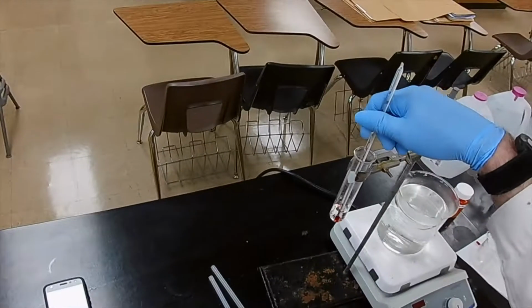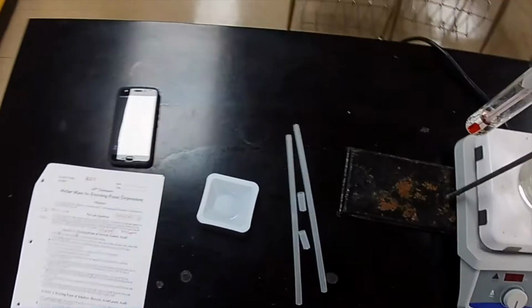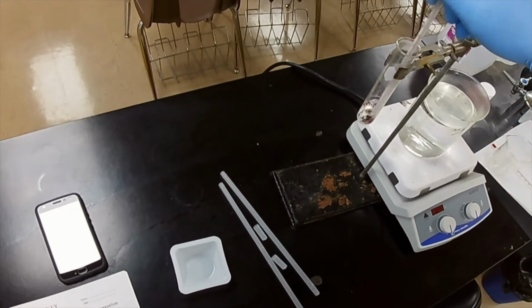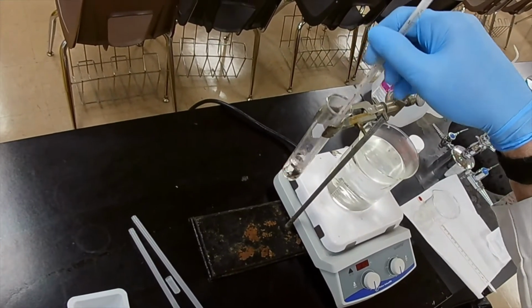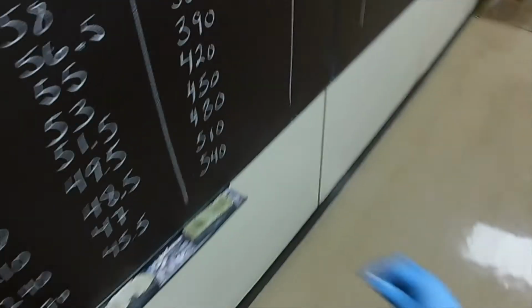Okay. 6 minutes coming up. 360 seconds. And this is 42. Okay. Ten seconds to the next one. I thought I saw a crystal, but I don't believe so. 41. Because the temperature's still dropping, and I think I knocked a piece off of the walls. 41.